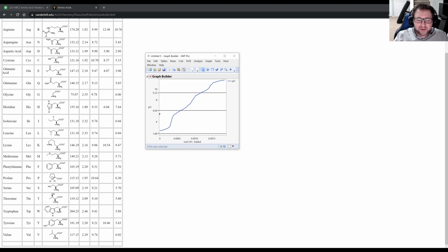All right. So do that a couple more times, export these, slap them into a single composite figure, A, B, C, D kind of thing. I guess ABC because you probably didn't do lysine.